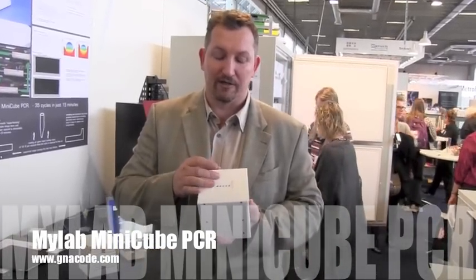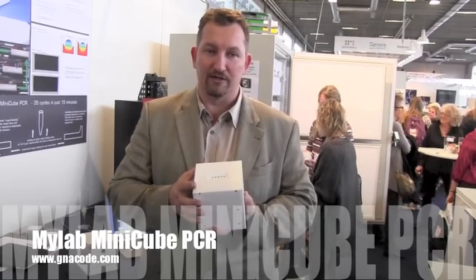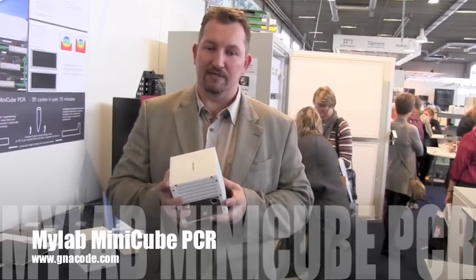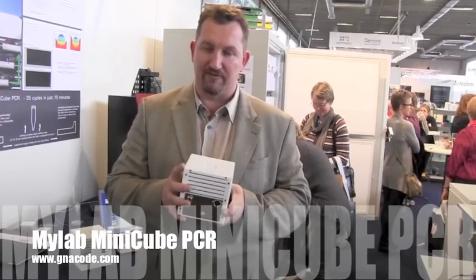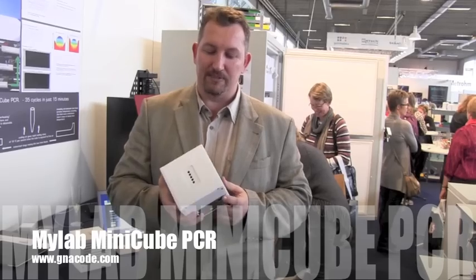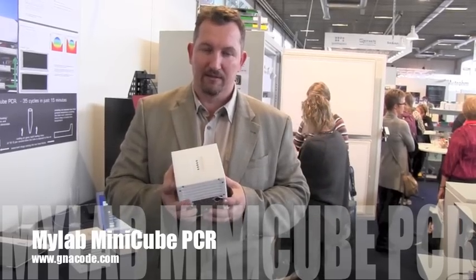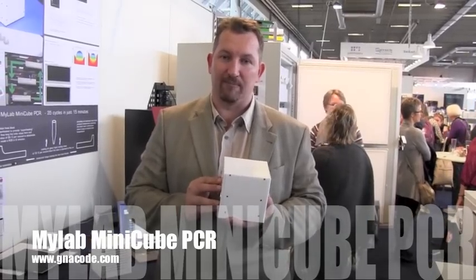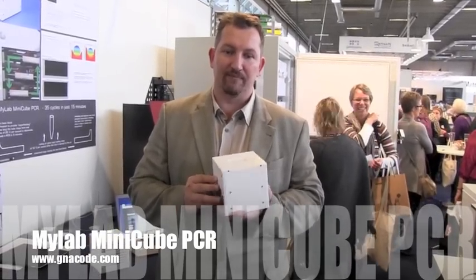We do annealing and extension in one position, and denaturation in another. In that way, we do two-step PCR, and the cycle time is really low — down to 20 to 25 seconds. You can achieve a full PCR in about 15 minutes, meaning you can check for sample presence in a very short time.